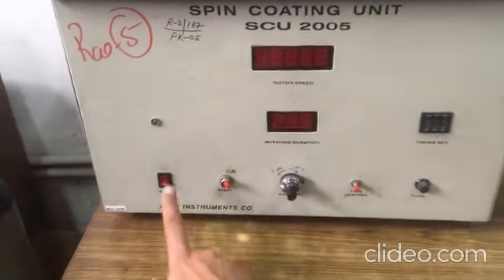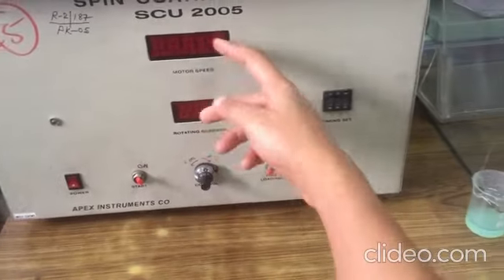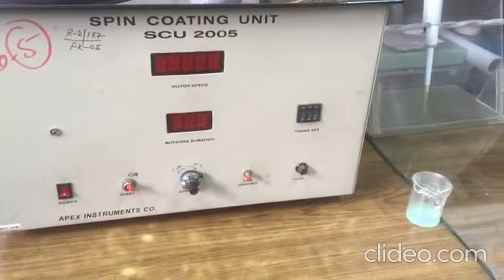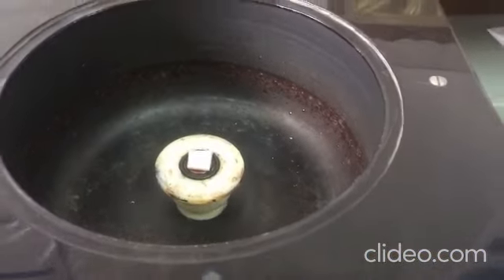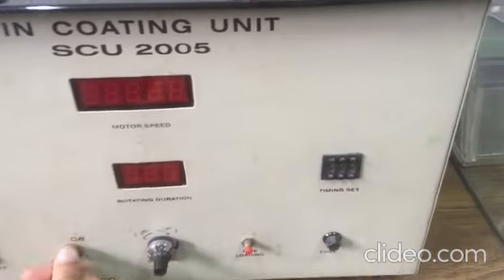Our spin coating unit has a power button, time loading button, and two displays - one for motor speed and one for rotating duration. This motor rotates, and this knob changes the speed while this button is for on and stop.